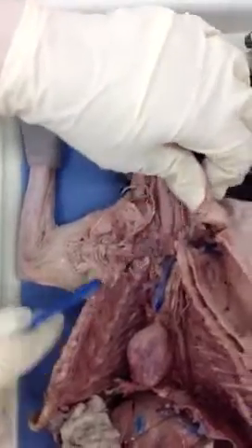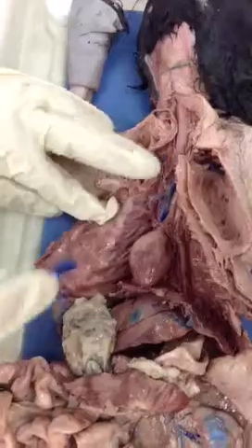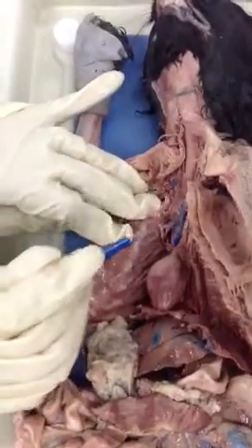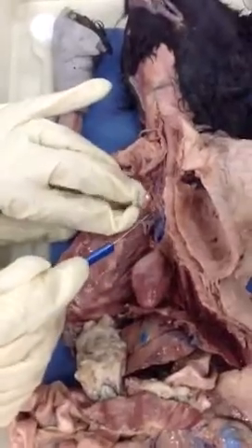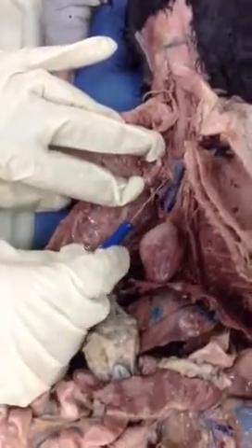And then to the other side, we see the left carotid. Very good. Now, I continue my journey, and I notice that the brachiocephalic is turning to the right. You see this vessel here? So then what is this blood vessel that I have here?